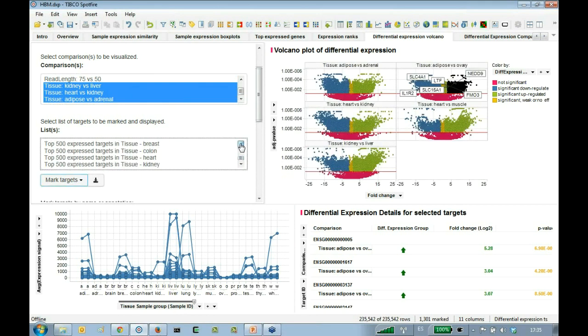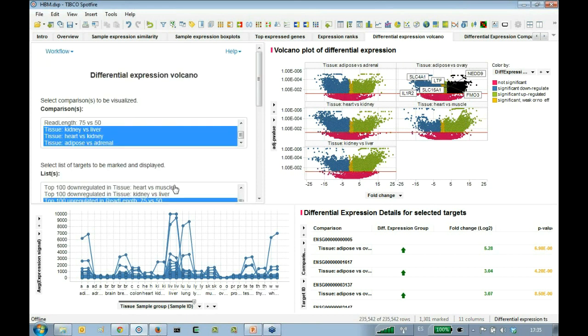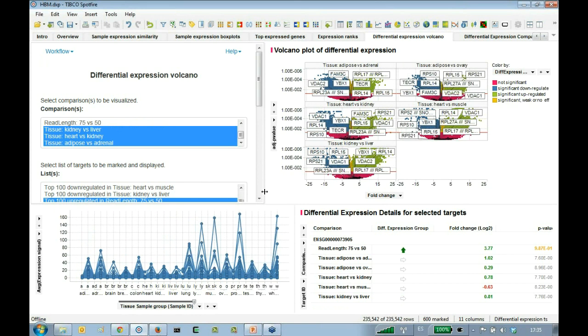we can easily see that those genes that are upregulated in these comparisons are actually all non-significant in the comparisons between the different tissues. So we can be quite confident that there is no problem using the different region that will affect a major number of genes.